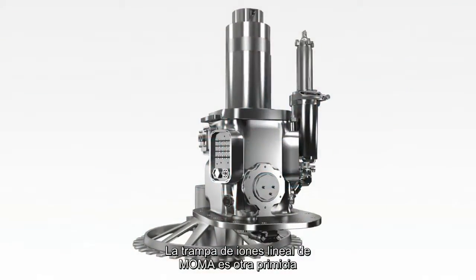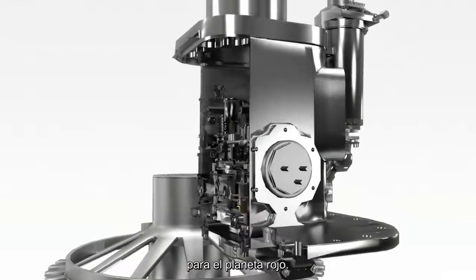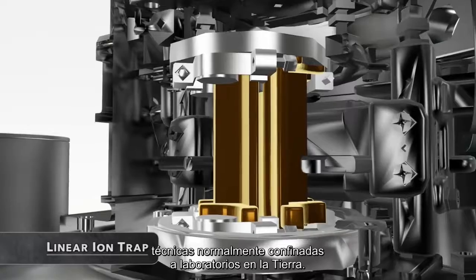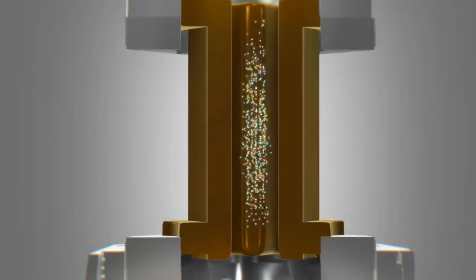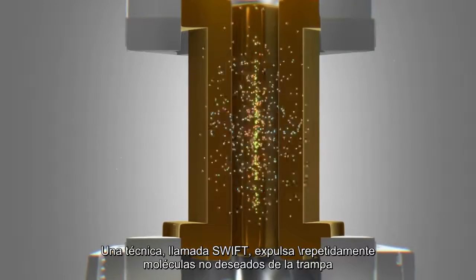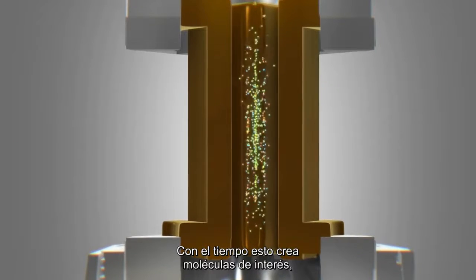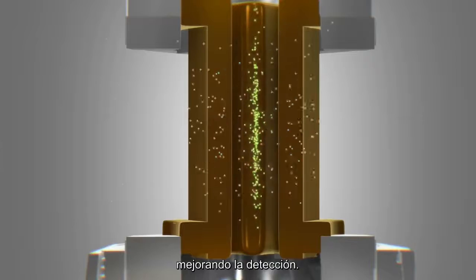MOMA's linear ion trap is another first for the Red Planet. It will scan for the fingerprints of life using techniques normally confined to laboratories on Earth. One technique, called SWIFT, repeatedly ejects unwanted molecules from the trap. Over time, this builds up molecules of interest, improving detection.